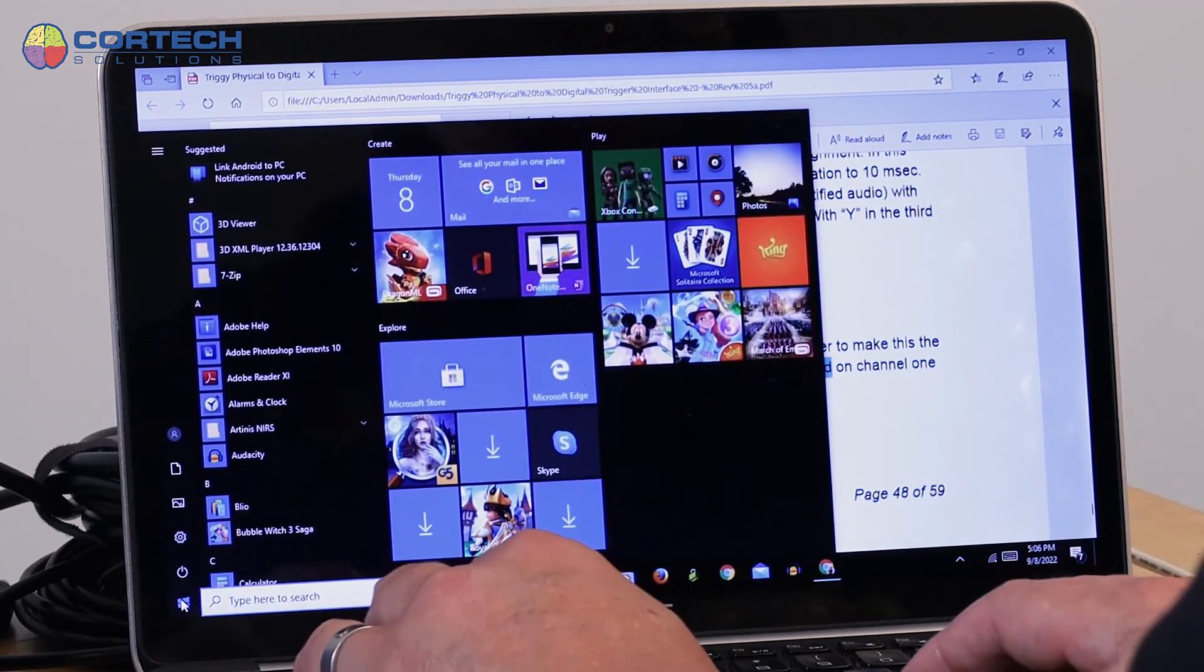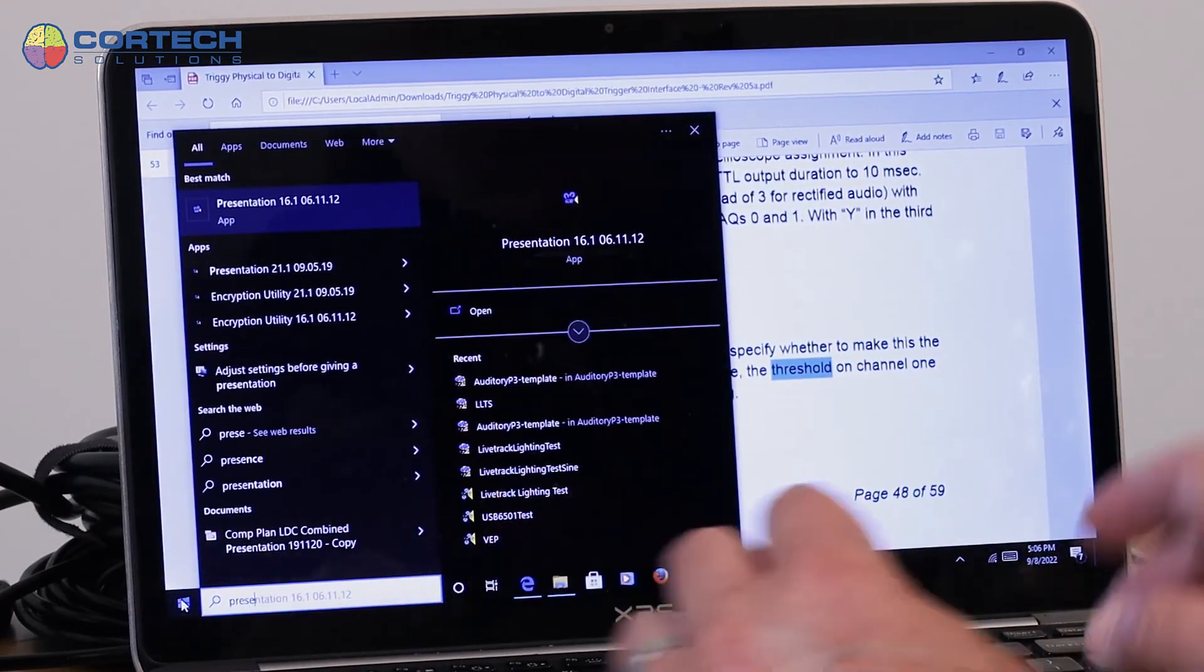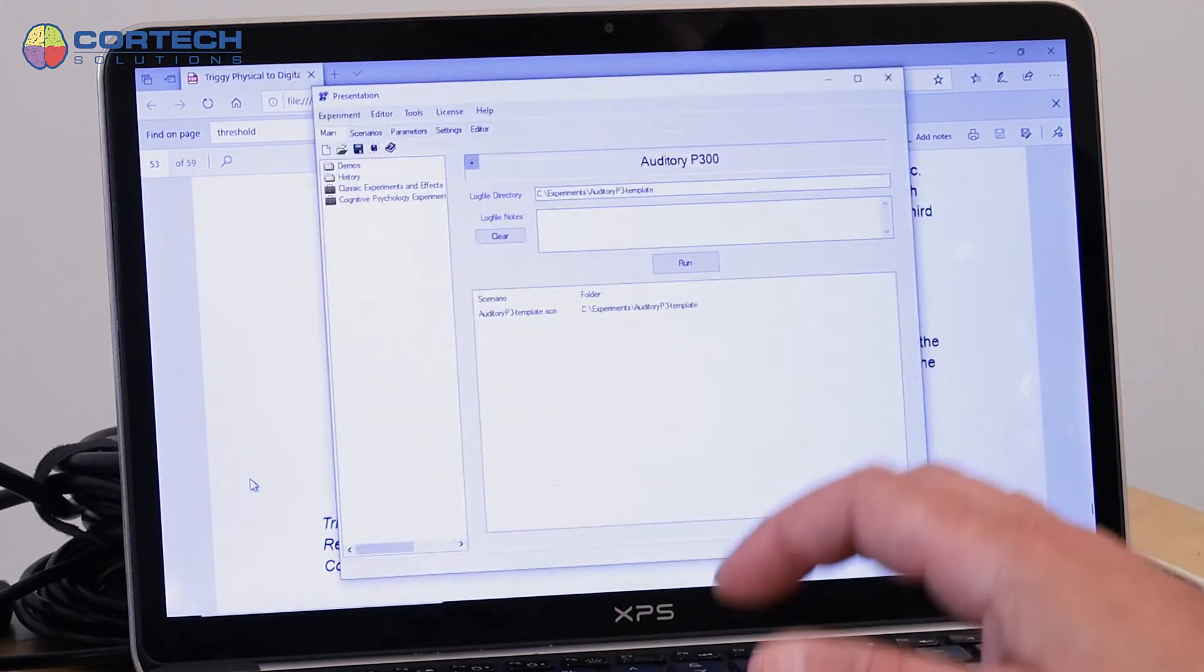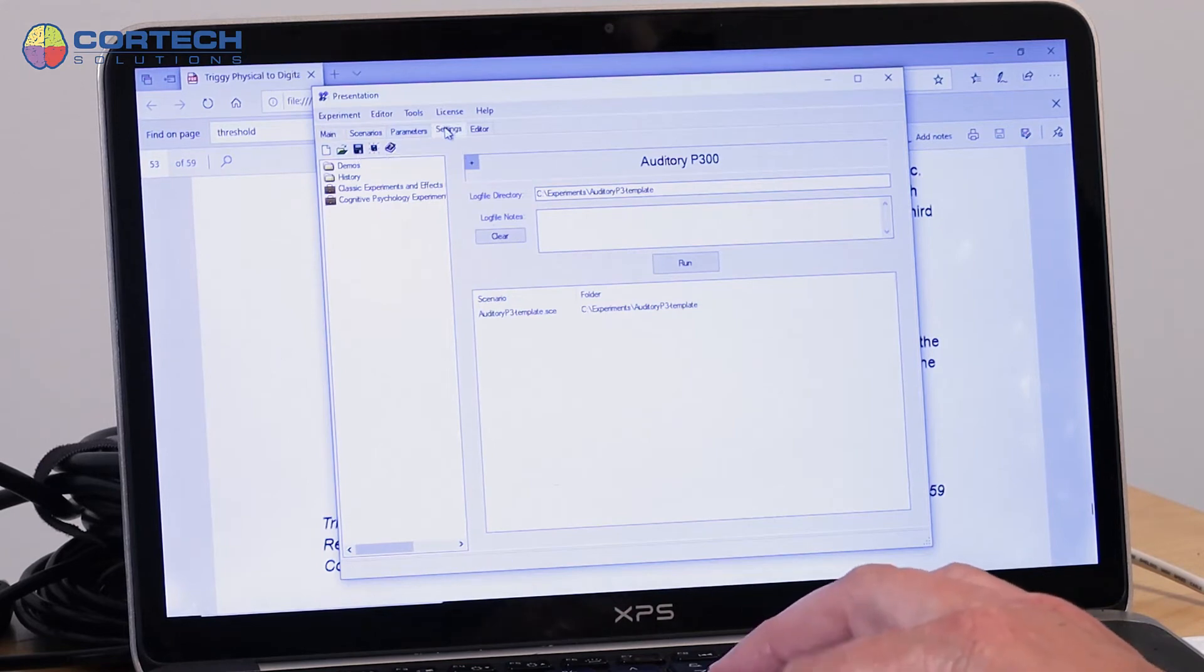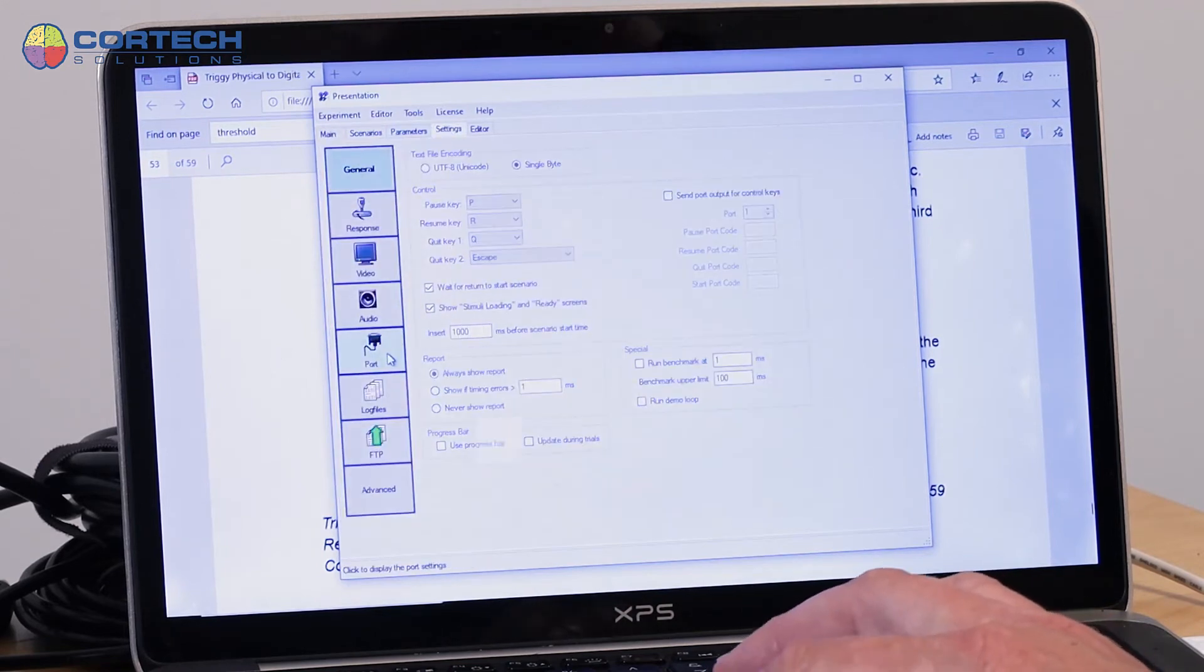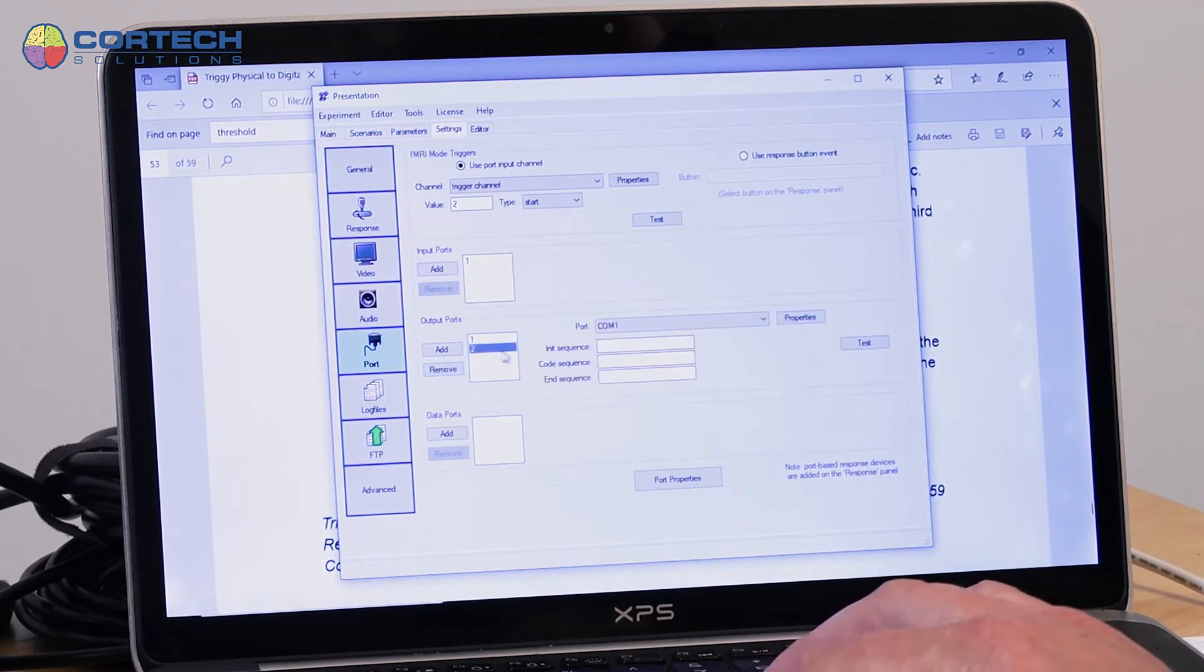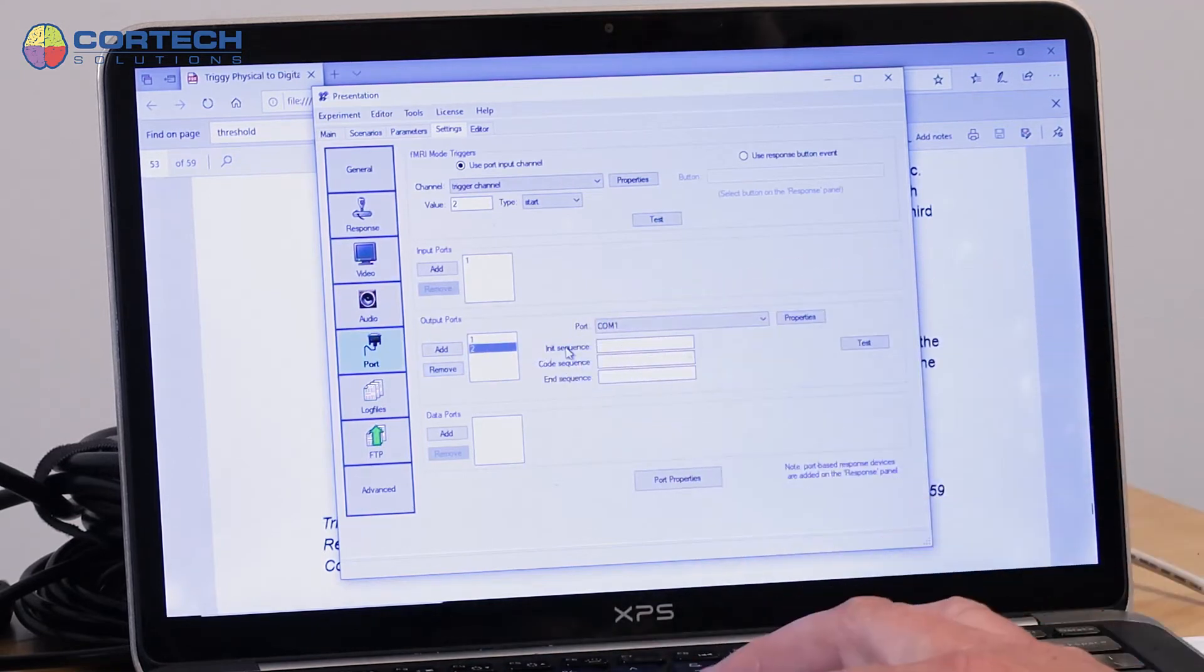That same kind of command. If I start Presentation, Presentation has a nice option, and your software may have this as well, depending on what you're using, to set some default strings to be sent to a port as an init sequence.